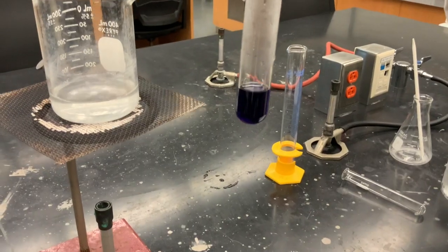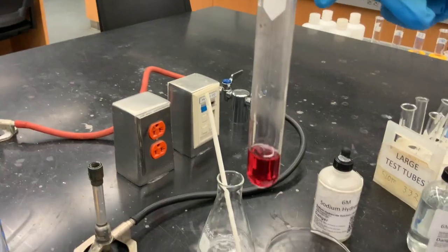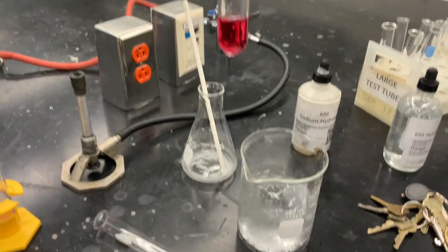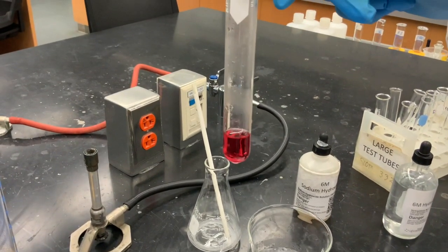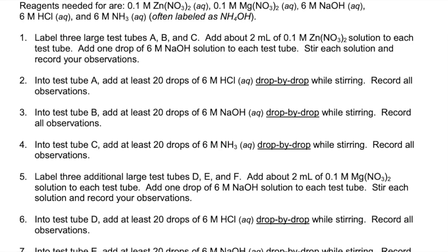We put the test tube in a hot water bath and see a clear color change in the complex ion solution. We then take the test tube out and put it in an ice water bath and notice another change occurring. Make sure you record all these color changes in your lab report.